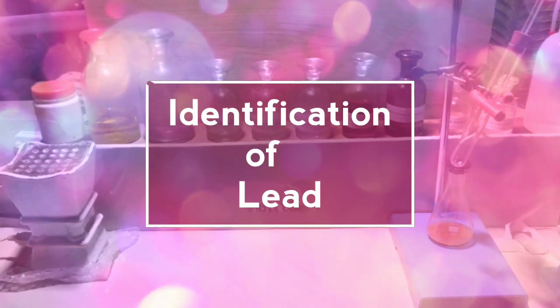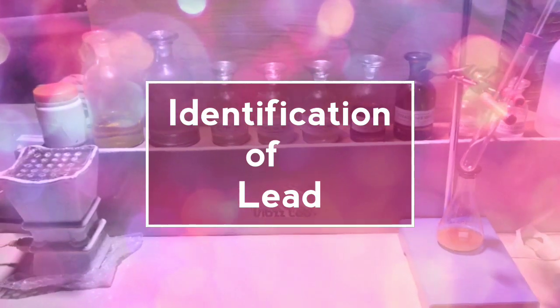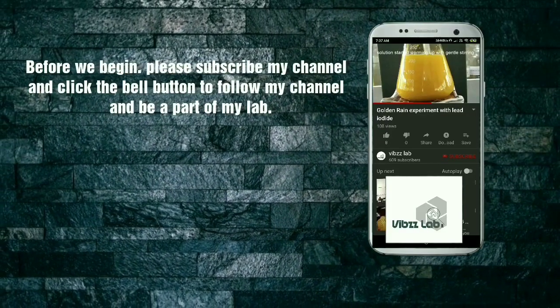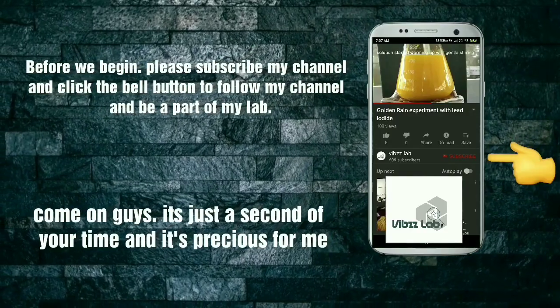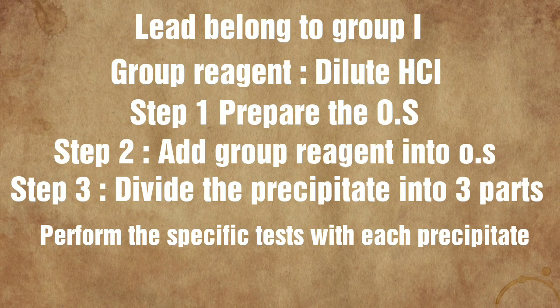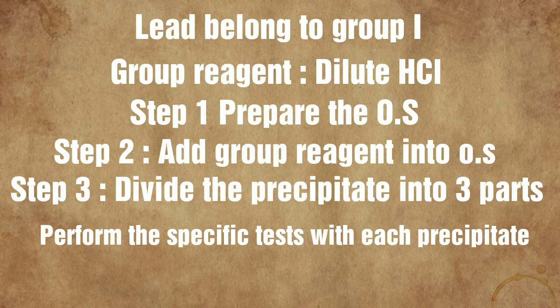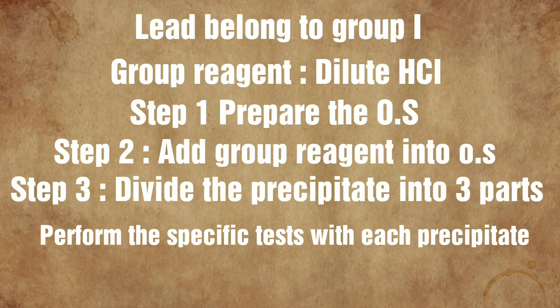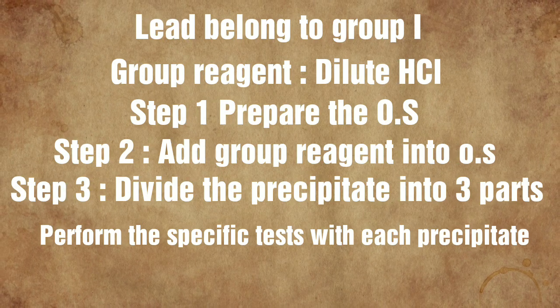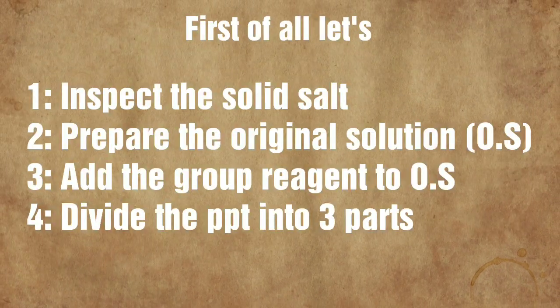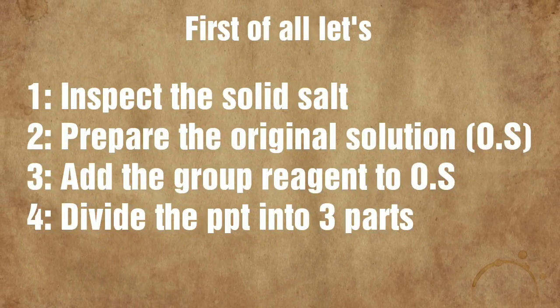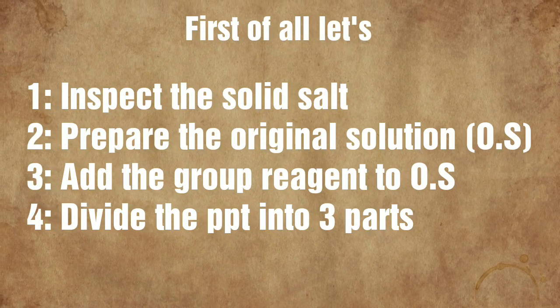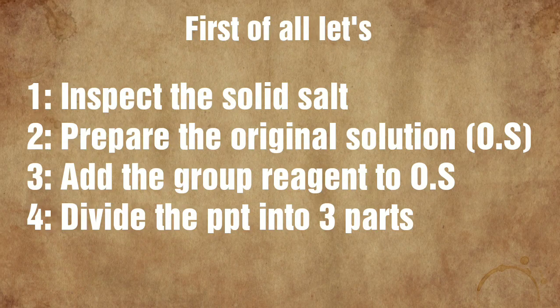Today we will be doing the identification of lead ions. The three basic steps are: prepare the original solution, add the group reagent to the original solution, divide the precipitate into three parts, and perform specific tests. First, we will inspect the solid salt, then prepare the original solution, add the group reagent, and divide the precipitate into three parts.